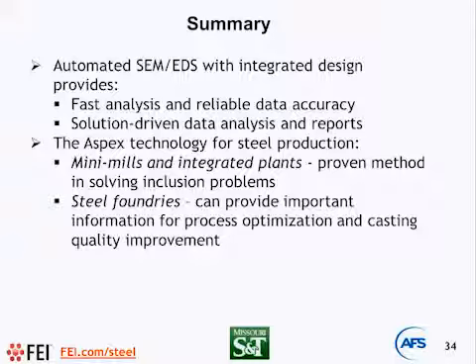All right, we'll do one more question before we close the webinar. And the final question is, how would you recommend gathering quantitative NMI data if you are limited to a light and inverted microscope?